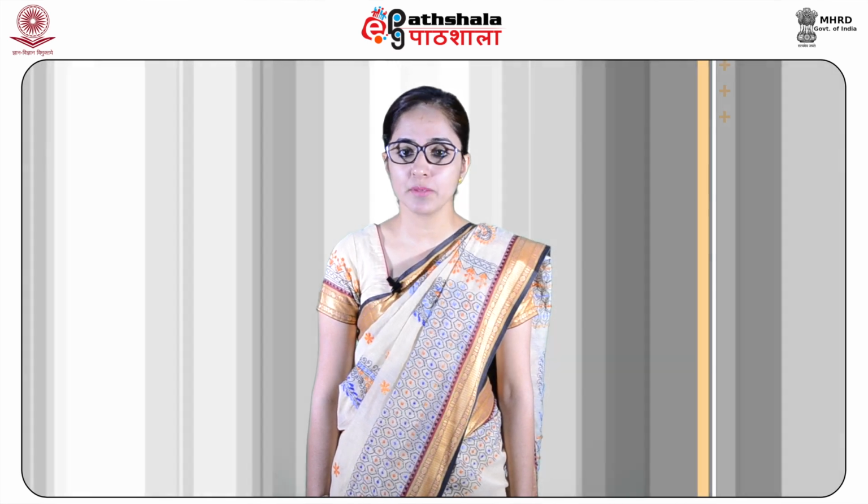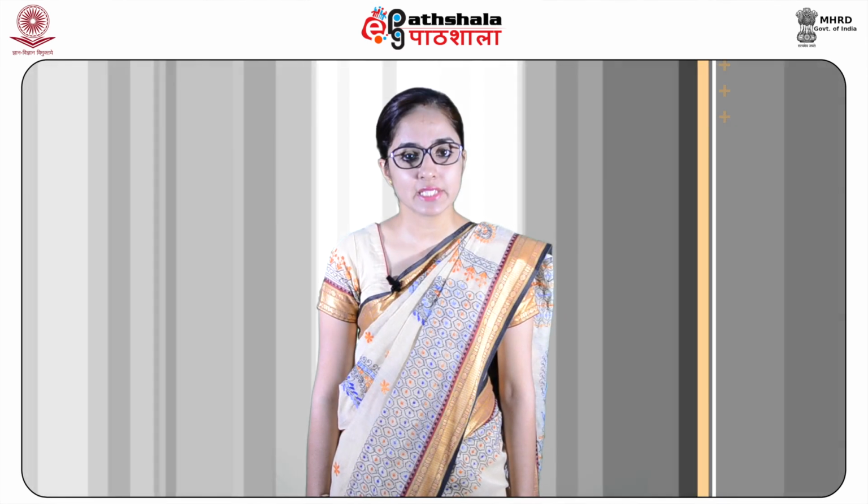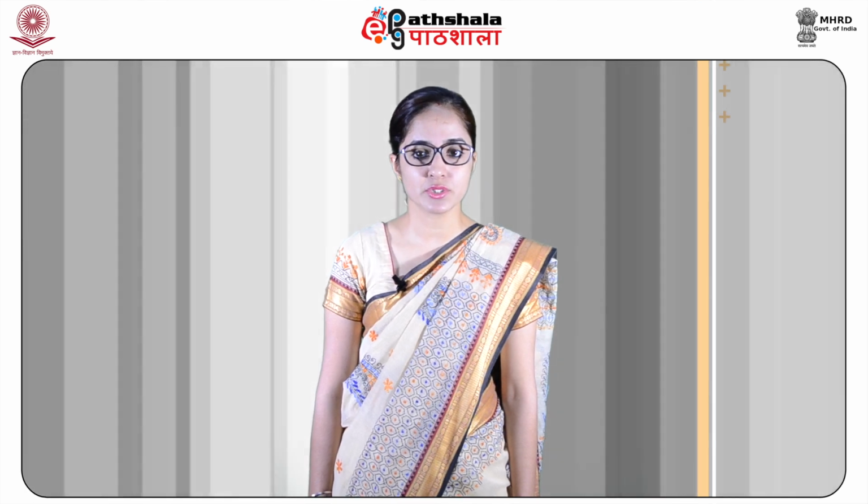Today, NMR has become a sophisticated and powerful analytical tool that has found a variety of applications in many disciplines of scientific research, medicine and various industries.